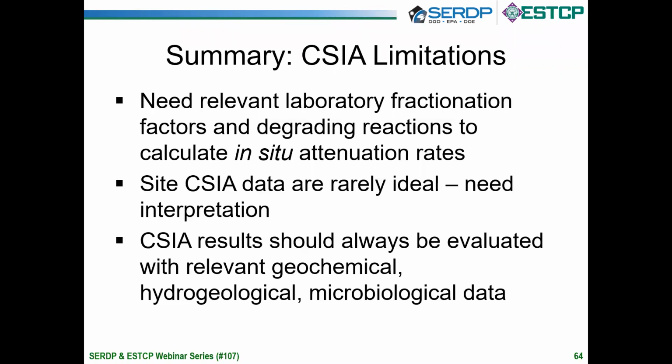Some of the limitations: you need relevant fractionation or enrichment factors, and some understanding of the degrading reactions to interpret the data. The data are rarely ideal. When you go to these talks, everything's a straight line. And I showed you one example where that's not the case. And typically when you get field data, those field data are not perfect, but often they're interpretable at different levels. And often they can be used to develop a much greater understanding of what's going on at a site.